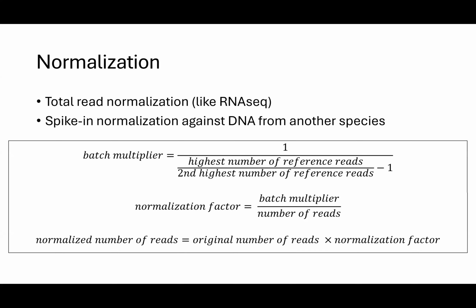You basically want enough of the E. coli DNA for normalization, but not so much that you're losing sequencing of the species you care about. That makes things easiest to compare between samples. It's still a bit hard to do those comparisons because you rely so much on having the same amount of cells and protein in the beginning, but it's the best way we have right now.